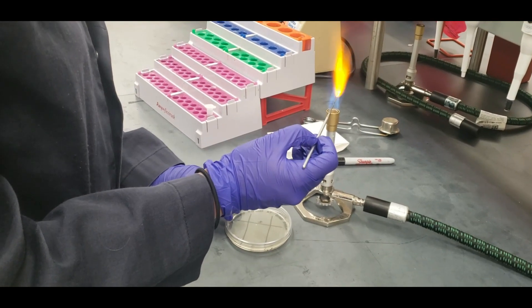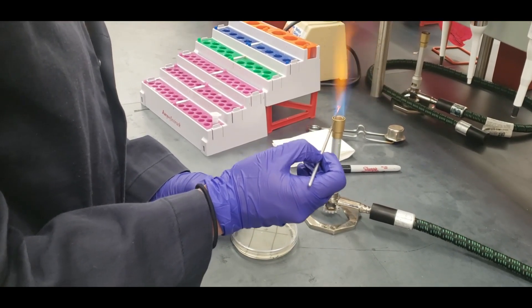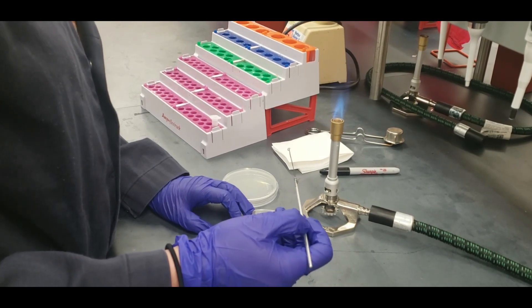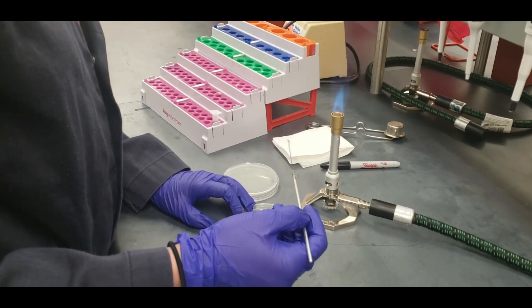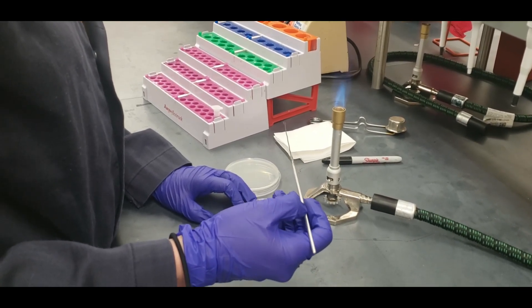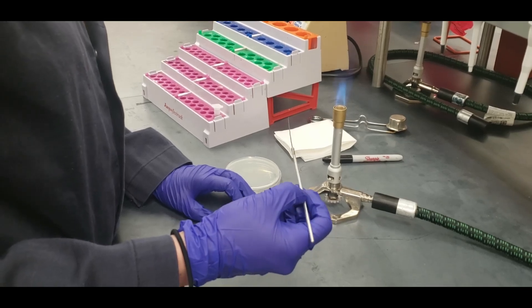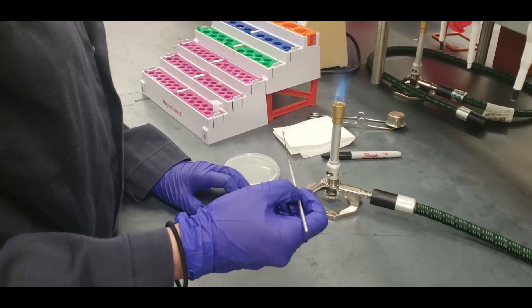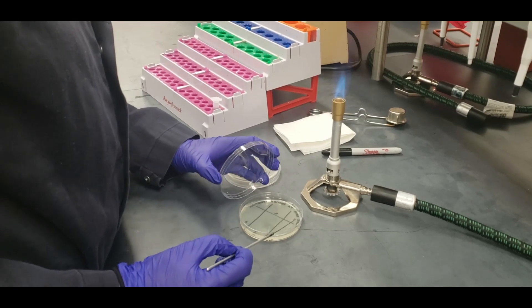You're going to flame your loop again, completely sterilizing it, making sure it cools. You're going to pull only one time from quadrant one into quadrant two. Make sure you don't cross over into quadrant one.